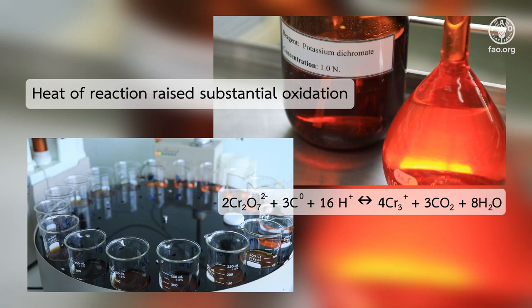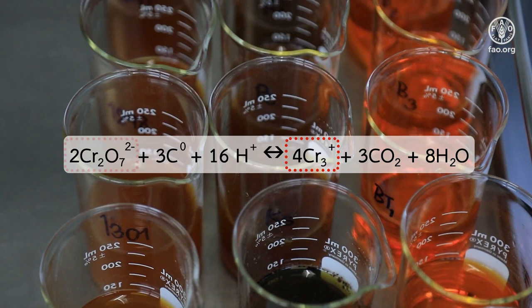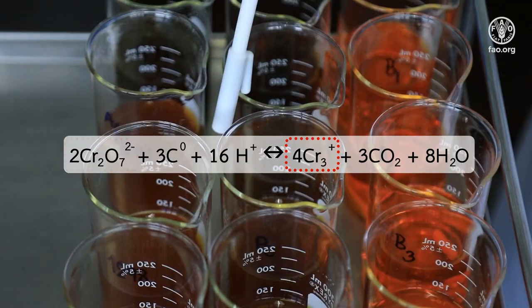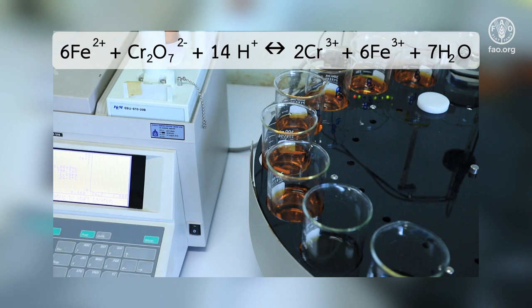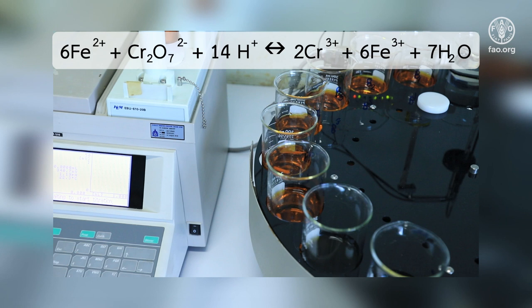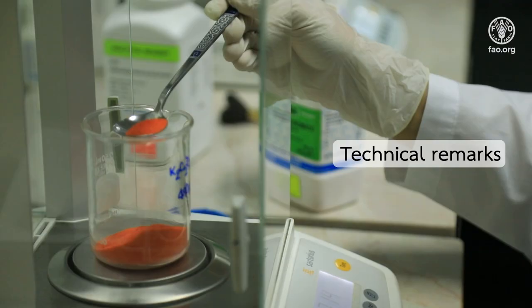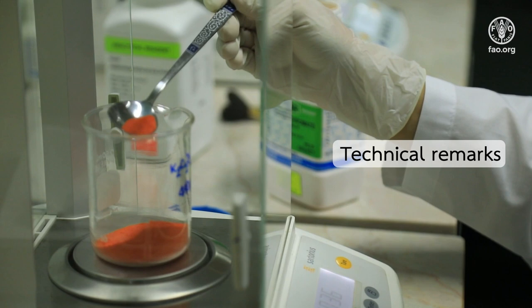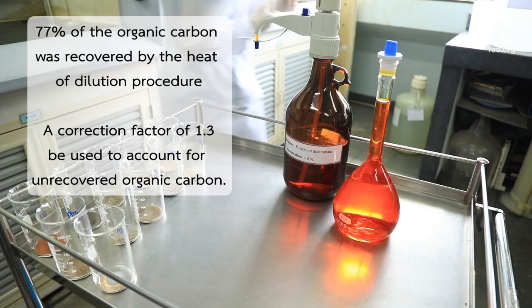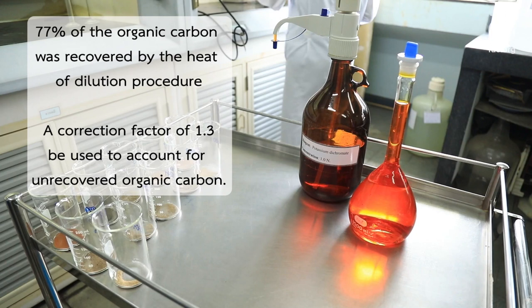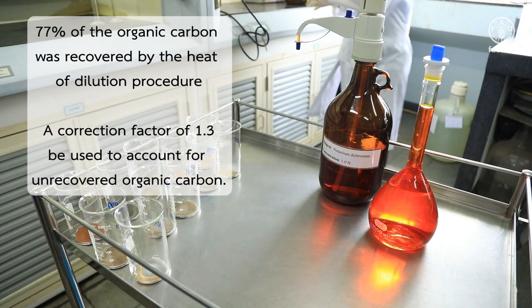The dichromate reduced during the reaction with soil is proportional to oxidizable organic carbon present in the sample. The organic carbon can then be estimated by measuring the remaining unreduced dichromate by titrating with ferrous sulfate or ammonium ferrous sulfate using diphenylamine or phenanthroline ferrous complex as an indicator. Regarding this procedure, some points might be noted. Walkley and Black found that on average about 77% of the organic carbon was recovered by the heat of dilution procedure.